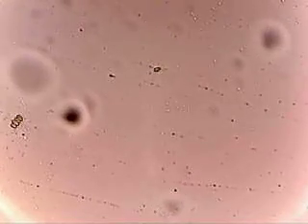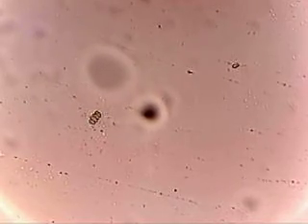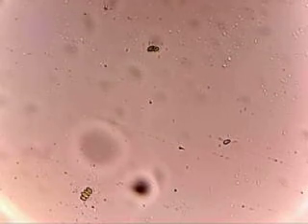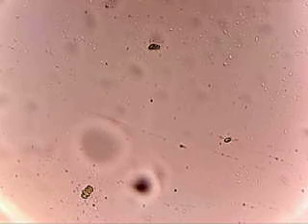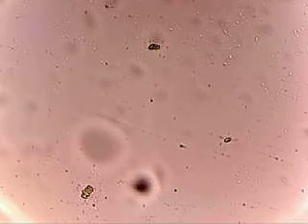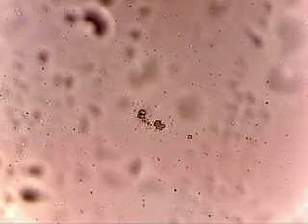Look at this. This is where I found, I think, the really interesting distribution. Here again, there's three within field, a group of four, a group of three, and a singular. And there are patches of bacteria around these things. They are arranging themselves nearby. And here again, a fairly numerous cluster of small ones and a couple of big ones, and here again bacteria swarming in that area, moving and non-moving.